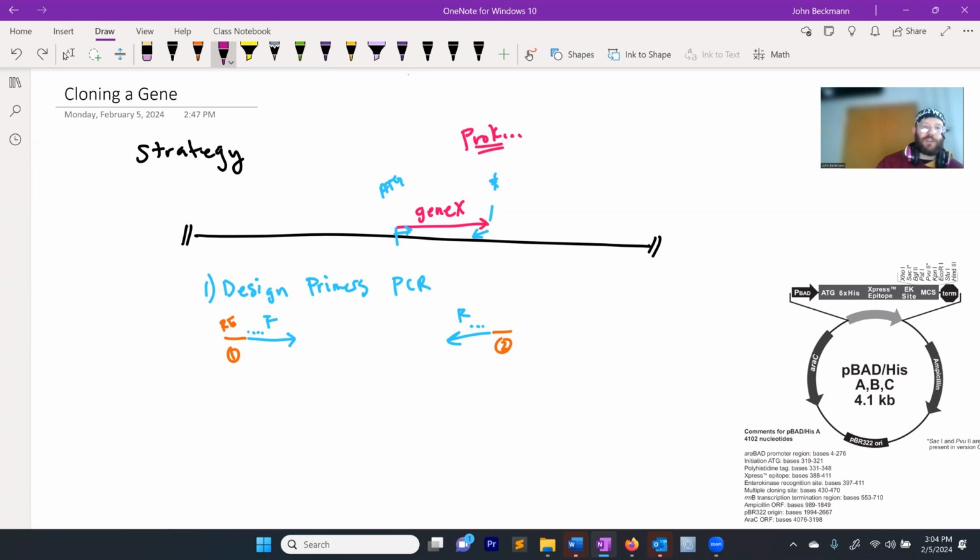So essentially your primers are going to look something like this. You have a section of your primer that binds to the actual gene. You have a section that builds the restriction enzyme sites into your amplicon. And then you have 4 random base pairs on both the forward and the reverse primers. Are there any questions on the most simple primer design? Okay, that's in a nutshell what we're going to do today.